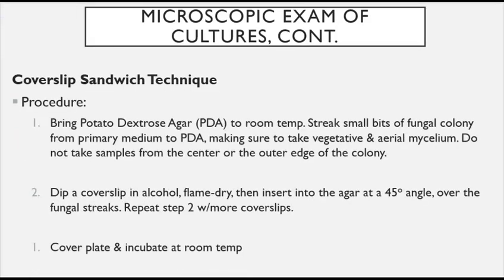Now that we know the advantages and disadvantages, let's talk about the exact procedure for the cover slip sandwich technique. You bring the potato dextrose agar to room temperature. You streak small bits of the fungal colony from the primary media to the PDA agar, making sure to take vegetative and aerial mycelium. Do not take samples from the center or the outer edges of the colonies.